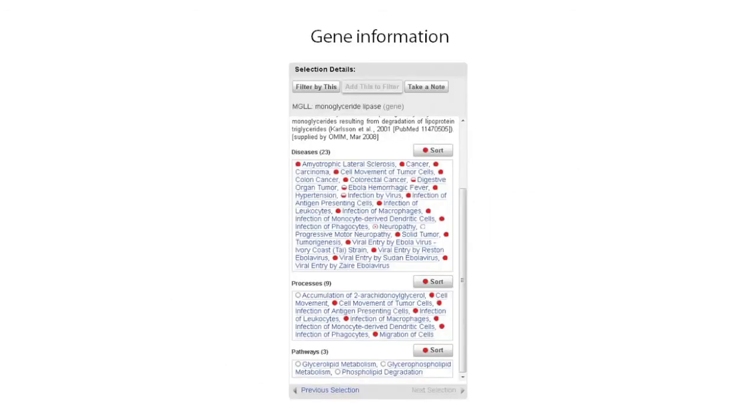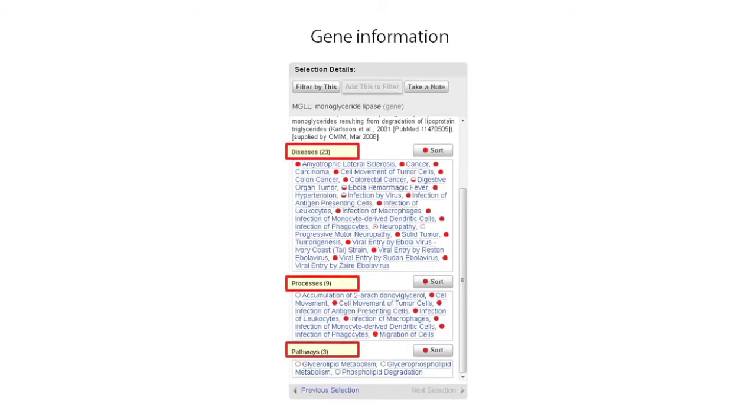Clicking on a gene reveals key information about the gene based on the known information in the literature, including the diseases, processes, and pathways it is associated with. As you find interesting information, you can take notes that will stay associated with the gene throughout the report.